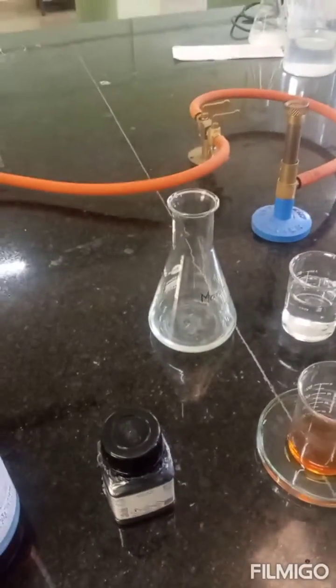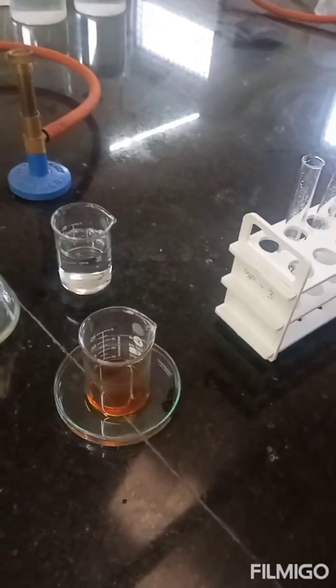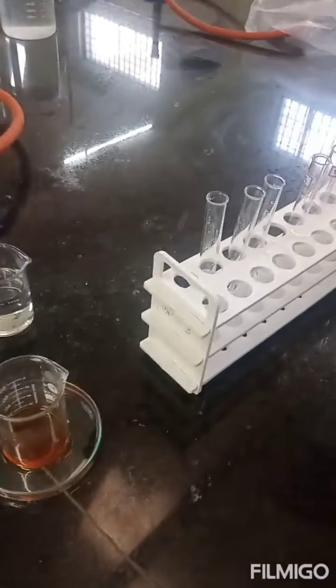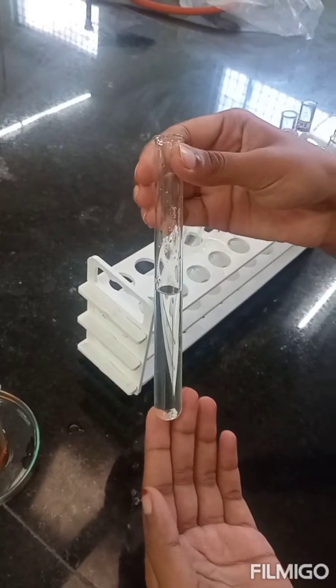We can use any carbohydrates for the Antheron test, all of which will give a positive Antheron reaction. The monosaccharide taken here is a 1% glucose solution.